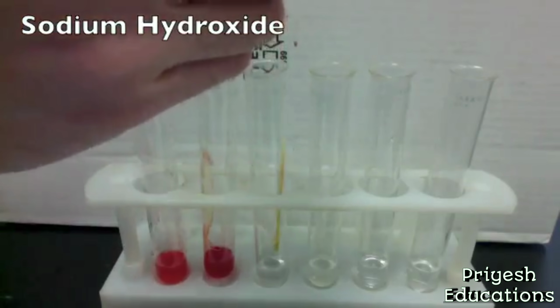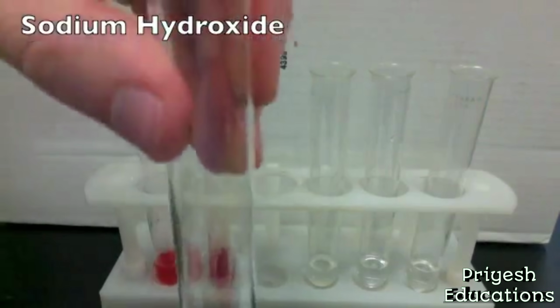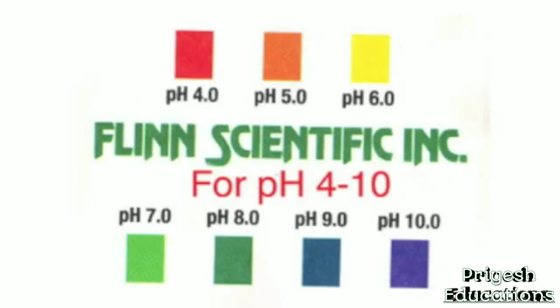Now we can test sodium hydroxide. With 1 drop of universal indicator solution for pH 4 to 10, it turns purple. According to our chart, purple means pH of 10 or higher.